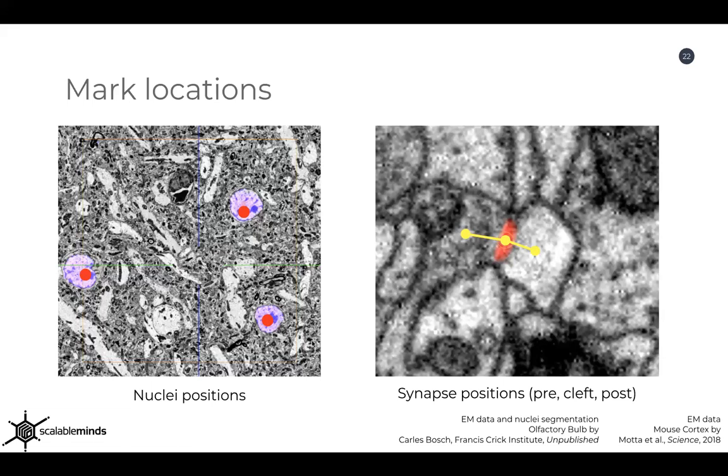What it won't tell us is basically if we get every voxel of this nuclei right, or if the contours are perfect. But for our use cases, that was not necessary. So that was a very fast way of getting some evaluation data for this project.